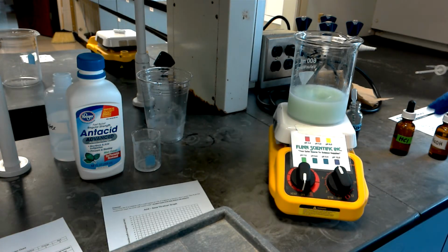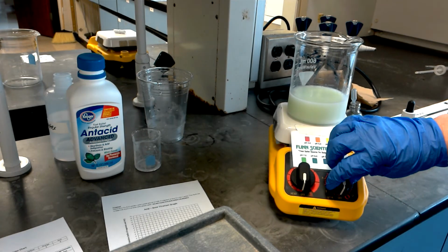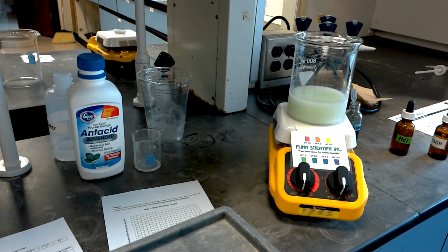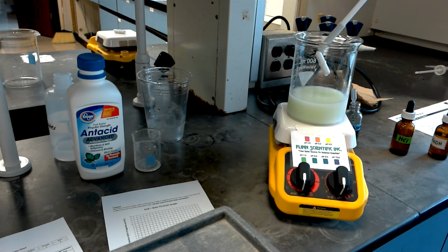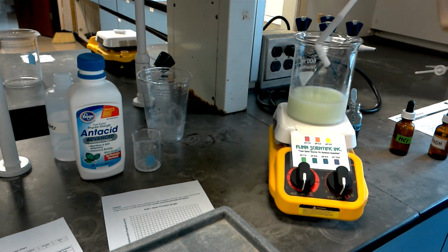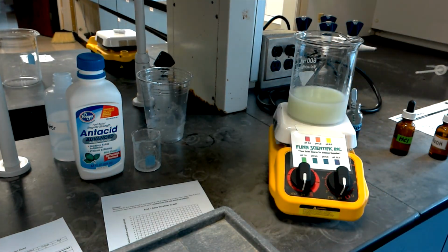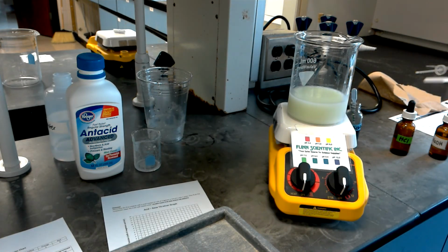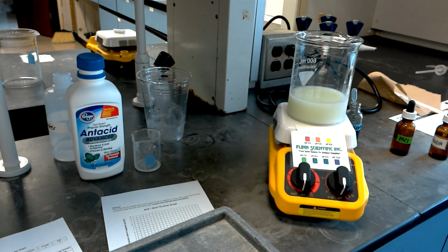Again, don't forget that before you pour this down the drain, you want to be able to get your magnetic stirring rod out of there. So we're going to slowly turn this off. We have a nice rod here that we use to capture the stirring rod out of the solution. And you want to rinse that off carefully before you get it ready for the next lab station or next lab group. And then we'll take this solution and pour it down the drain with excess water. Good luck in your post-lab discussions.